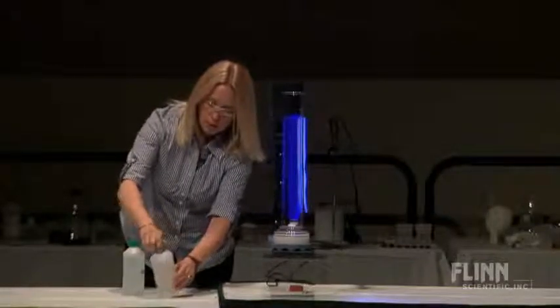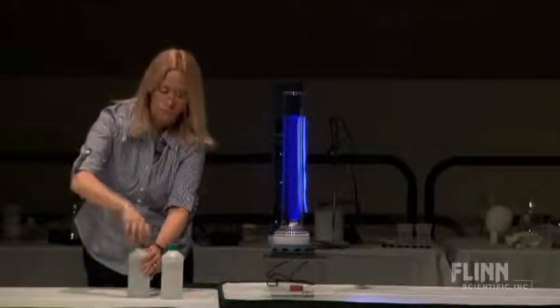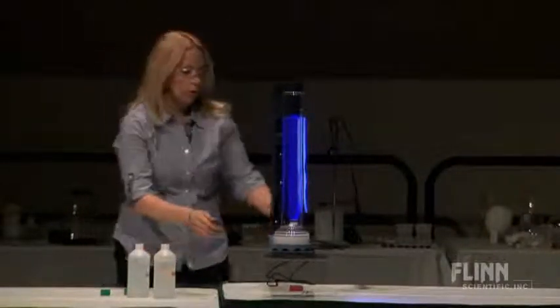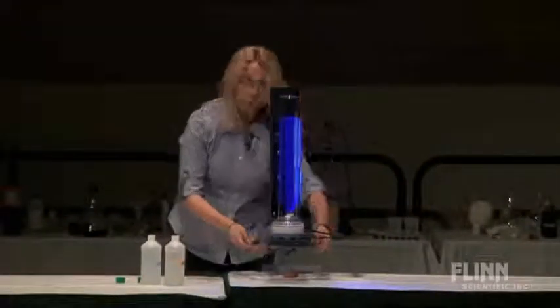She said, really, really, it's an oscillating reaction. Then I saw the equipment list and chemical list for it and I was like, oh my God. But we'll do it anyway.